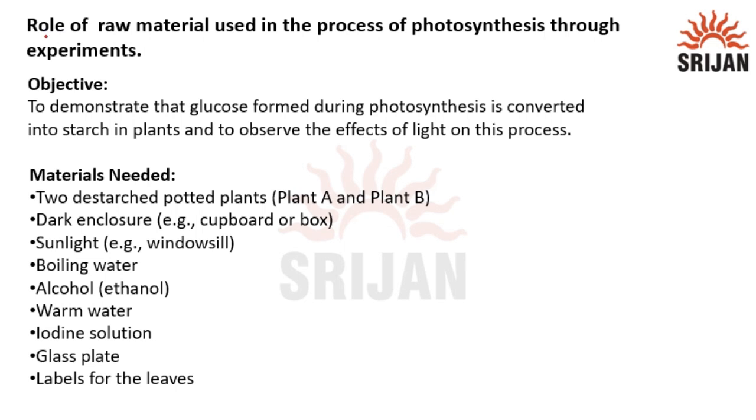In this video, we will learn about the role of raw material used in the process of photosynthesis through experiments. Objective: to demonstrate that glucose formed during photosynthesis is converted into starch in plants and to observe the effect of light on this process.